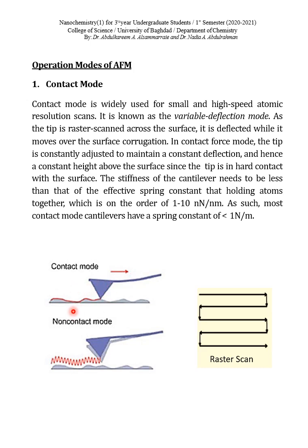بصورة عامة هذا schematic يوضح ال two operation systems اللي حنتطرق إليه بهذه المحاضرة اللي هي ال contact and non-contact modes. obviously من الاسم إنه ال contact هو يعتمد على ملامسة التب ويا ال roughness of the surface أو ويا profile of the surface. وال non-contact mode يعتمد على oscillations أو نتيجة تآثر التب ويا ال profile of the surface.